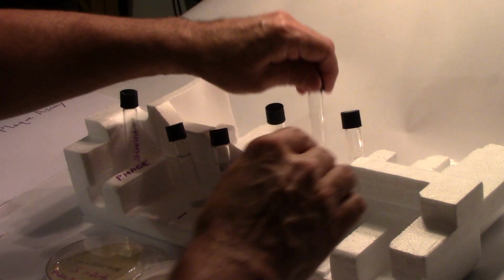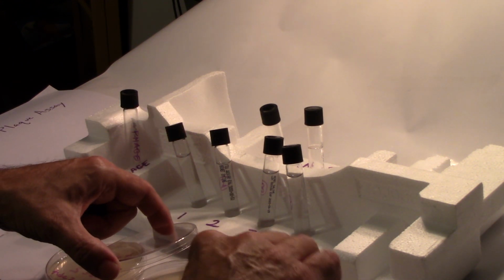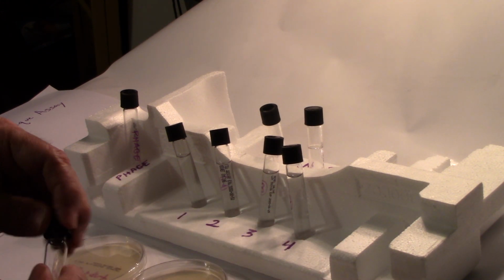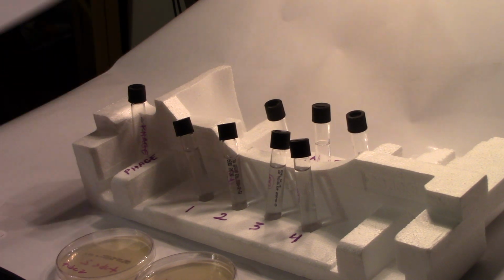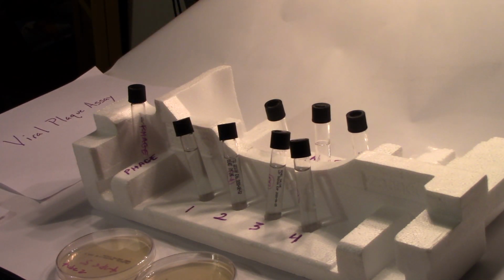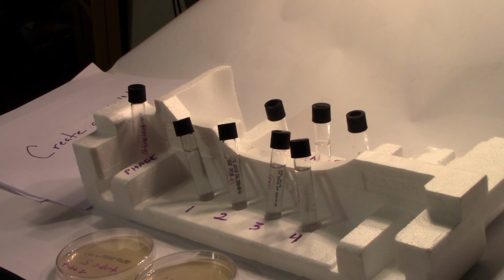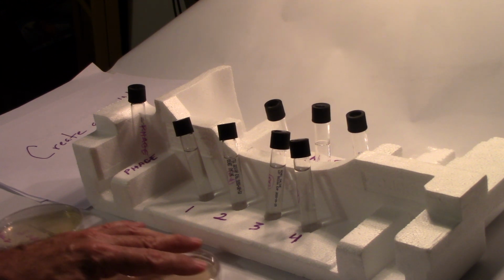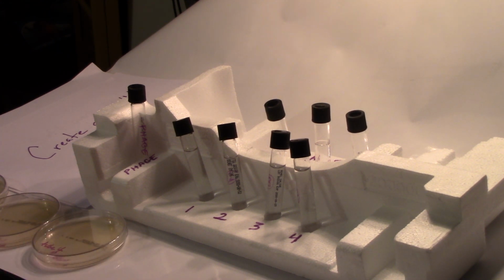Now I have results that I'd like you to see. This is tube number 4. I do have results I want you to see so that we can analyze this and do counts. So these are the tubes. Now what I want to do for this viral plaque assay is, I have now created a lawn of bacteria with the phage, and we're going to try to count. So I'm going to move these off to the side because I did this the evening before. I have tube number 2, 3, and 4. I'm going to take the covers off so you can see these, and I'm going to bring this over so that you can see what's happened.